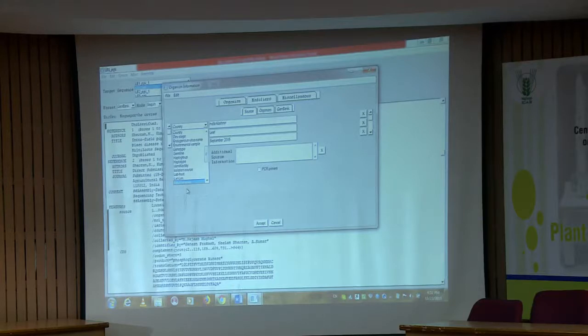You have to simply click and keep on adding the information and keep on accepting or saving that. Once you accept it, that will be directly highlighted in your flat file, right. So, if you can just see, there are several options starting from your culture, collection date, country, then environmental sample, genotype, all possible information you can enter over here, right. So, this is another thing.